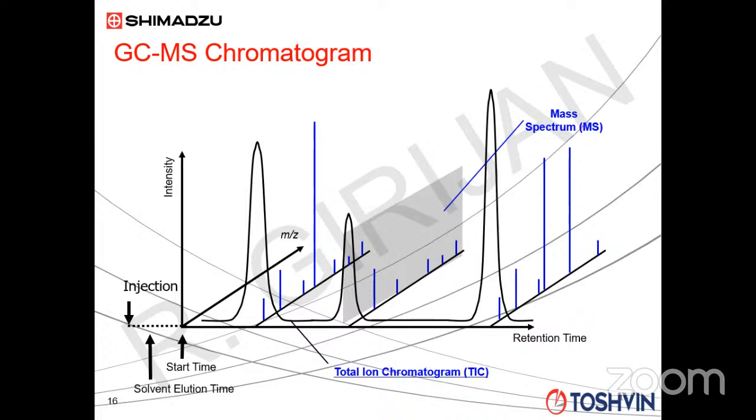I am not underestimating the power of conventional GC. It is a very, very powerful technique. But the only drawback is it cannot give you an automatic identification. You require standards, that's the only limitation. But when it comes to GC-MS, that is also overcome. You can identify the compound without the reference standard.